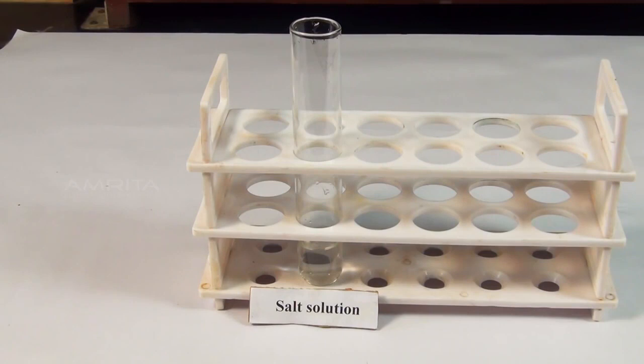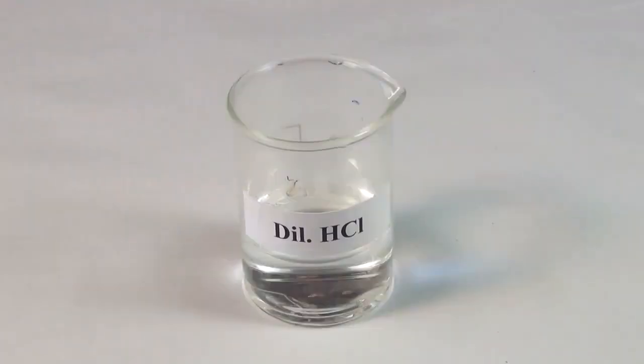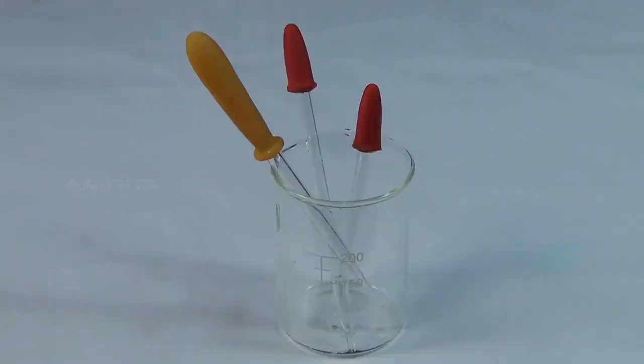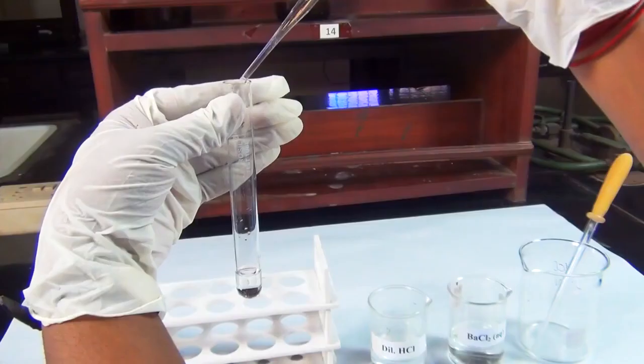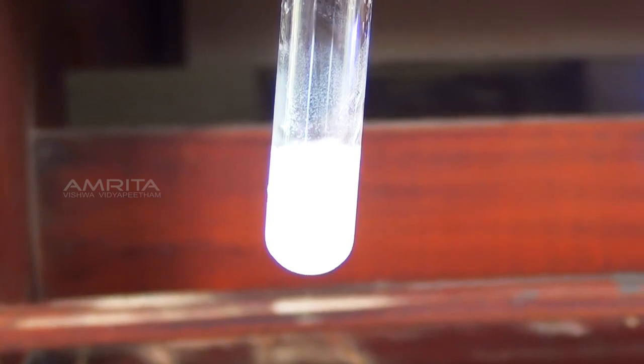Materials required: aqueous solution of the salt, barium chloride solution, dilute hydrochloric acid, test tube and droppers. Procedure: take a small quantity of aqueous solution of the salt in the test tube. To this, add a small amount of barium chloride solution using a dropper.